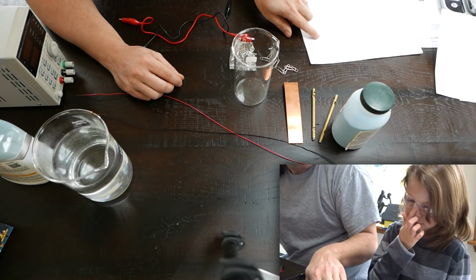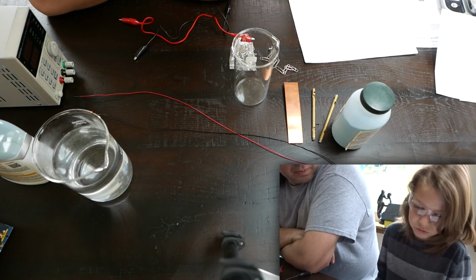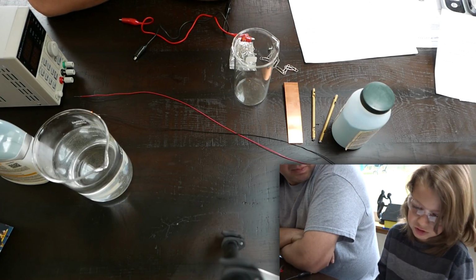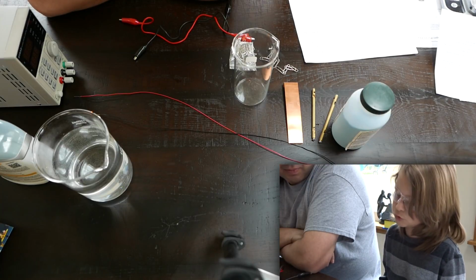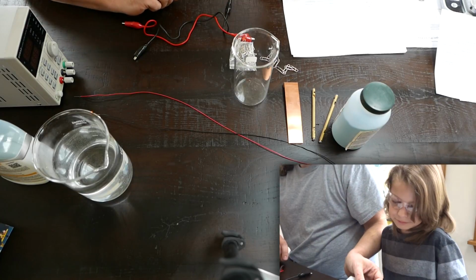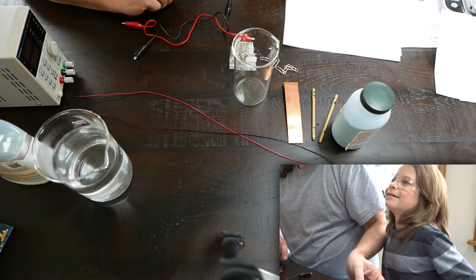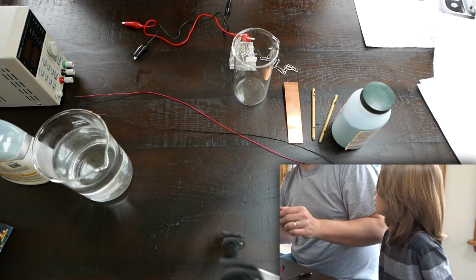Let's see. Okay, and then what's the instability, which is the yellow one? Which is 0. Normally stable, even under fire exposure conditions. It is not reactive with water, which we will be using. Yep. So we're all good there, right? So you got your safety glasses on, right? We're gonna put some glasses on. I already have them on. Yes. You already have yours on.